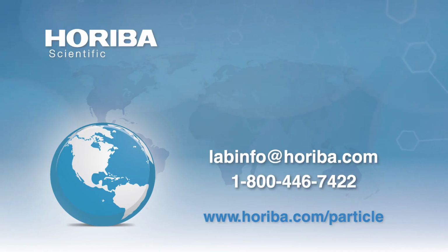Thank you. Yeah, I think we know labs who run the instrument on a 24/7 basis. Now, the next question is, could you label smaller proteins? Yes, we can. Particularly if you're labeling a protein, you're not going to get that many labels on it. There is some potential to use gold nanoparticles as labels, and then that would work.